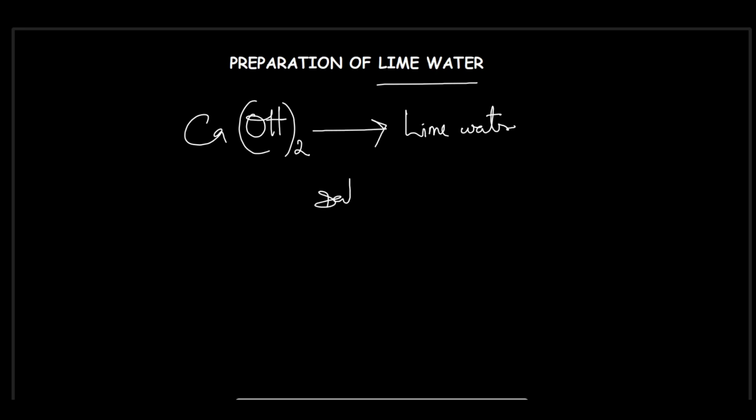Alright, when you hear the word saturated solution, it is a solution in which no more solute can dissolve at that particular temperature. So when you want to prepare this, you should expect to see some insoluble solute. And take note of this: calcium hydroxide is sparingly soluble in water. Calcium hydroxide is used to identify the presence of carbon dioxide gas.